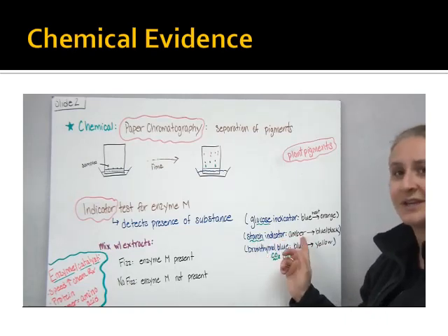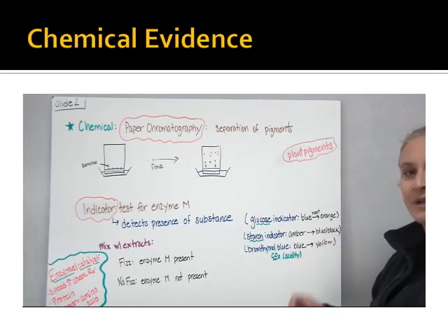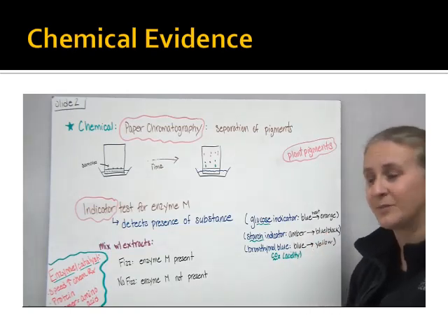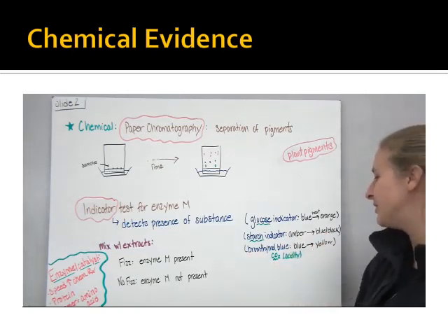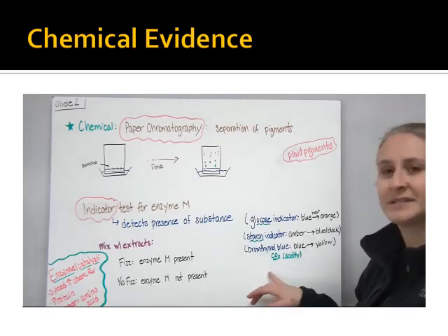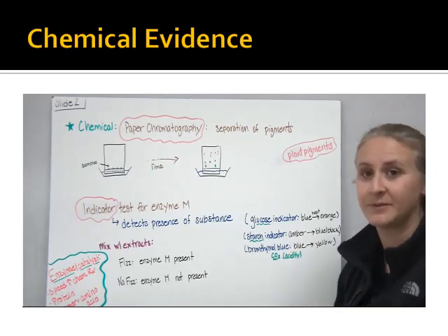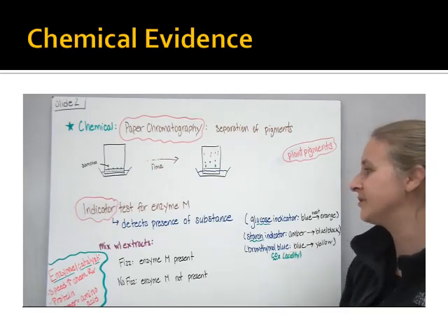We've used a starch indicator, which we typically call iodine, which started off as an amber or rust color and would turn a bluish black in the presence of starch. And then we've also used bromothymol blue, which was a test for acidity and carbon dioxide presence. It would go from blue to yellow if carbon dioxide was present or if it was an acidic solution.